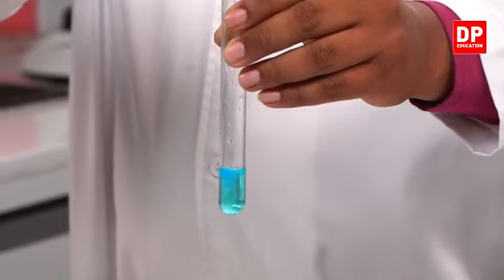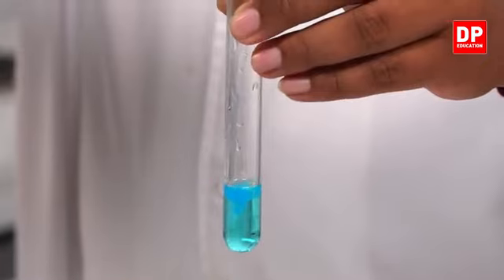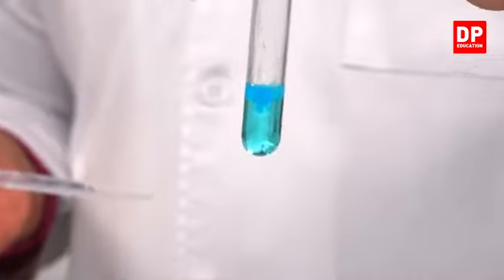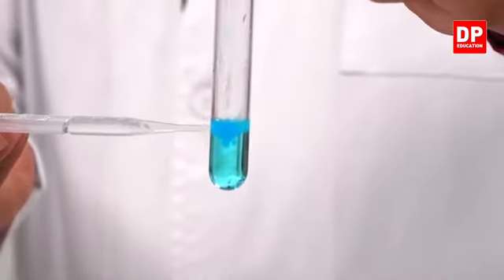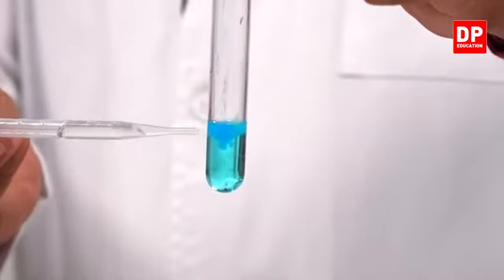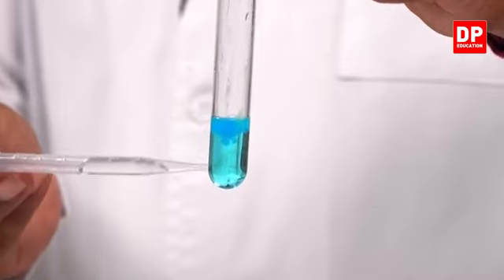Check the observations clearly. You can see there is a change in complexion. There is a change in color. See the top part, the color of this part is somewhat darker than the color below.